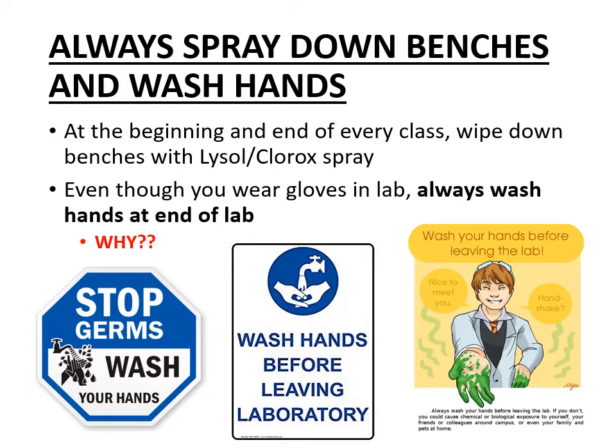Now, this slide is very important when you're working in any microbiology lab. Always make sure to spray down your benches before and after you do anything. Okay, so you spray them down with whatever disinfectant the classroom has available. Sometimes it's Lysol, Clorox, or just a bottle that generically says disinfectant. But always make sure you spray down those benches at the beginning and end of every class.